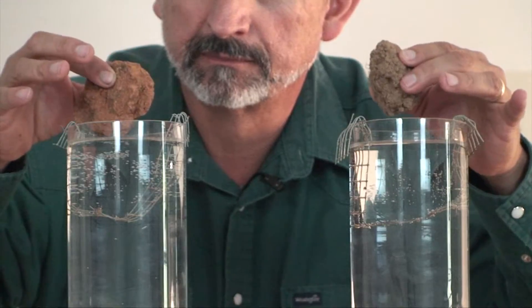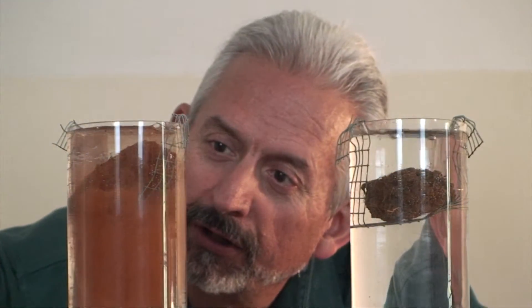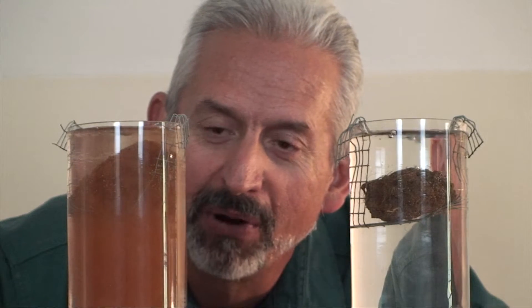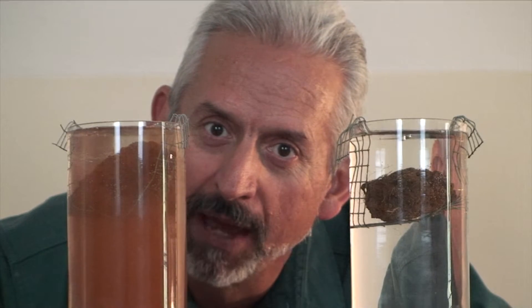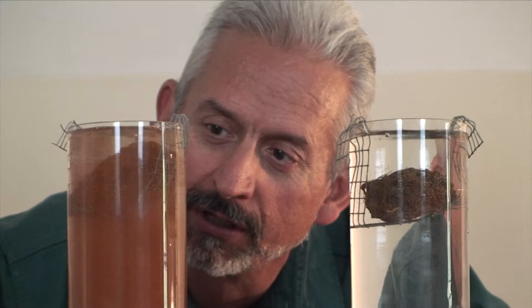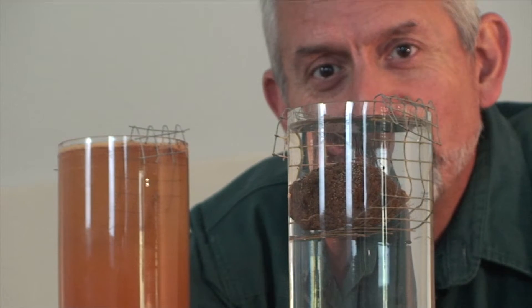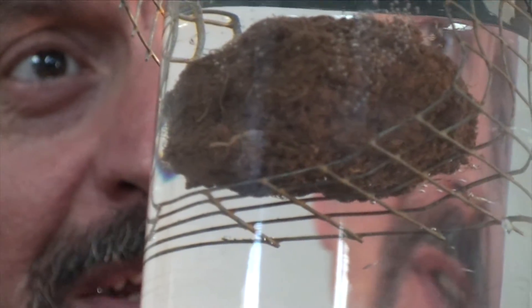Watch what happens when we drop the soil in the water. Notice how the conventional till soil is falling apart — the biotic glues in the organic matter are burned up by tillage, and the soil pores have collapsed. Notice the no-till soil: the soil is holding together, and the pore spaces are still intact.